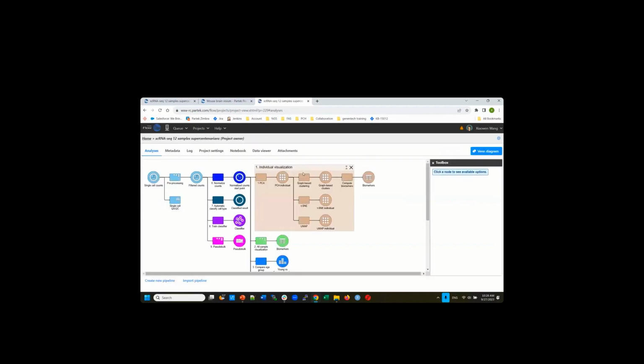So this is the technique I really highly recommend you use, this unique feature in Partek Flow, to analyze each sample individually. But if you have a lot of samples, suppose I have 100 samples, and my major classification technique is based on gene expression, then you probably don't need to do it this way.